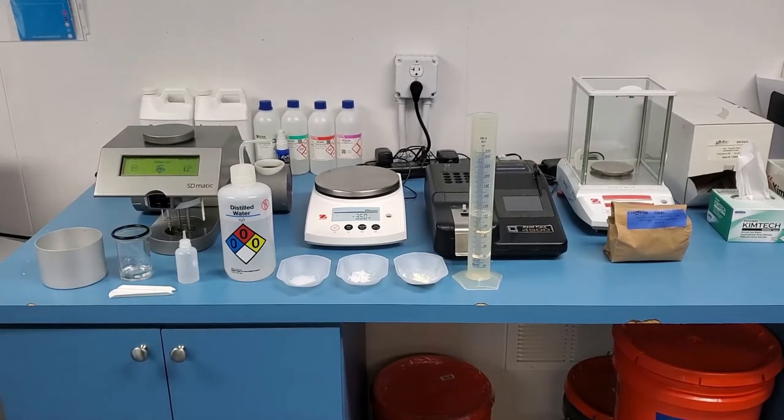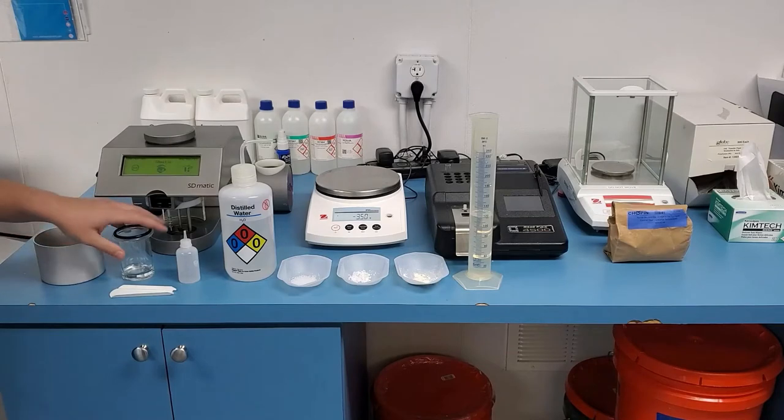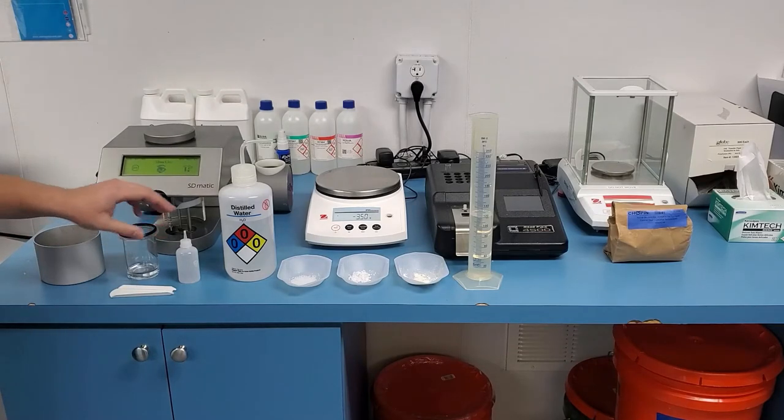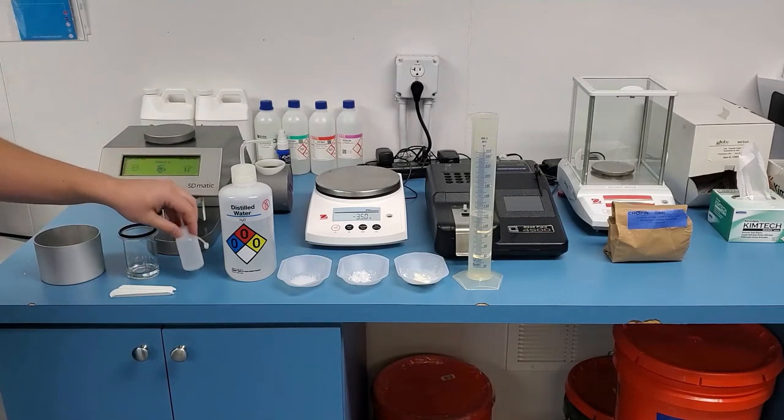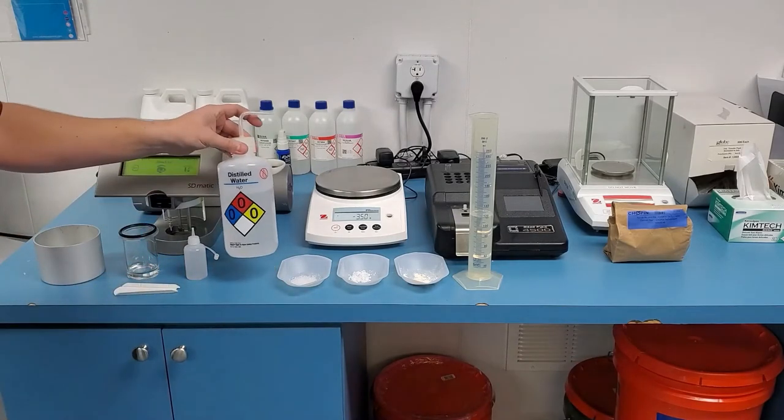After the device is powered on, you will have a few items that come with the unit in order to run a test. You will have the rinsing bolt, the reaction bolt, the sodium thiosulfate dropper, flour spoon, and distilled water sprayer.